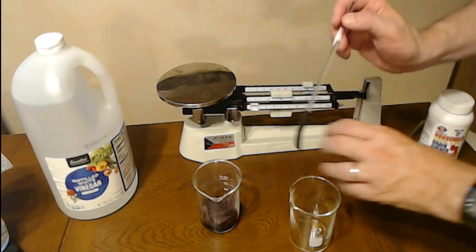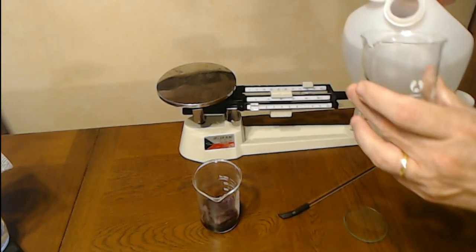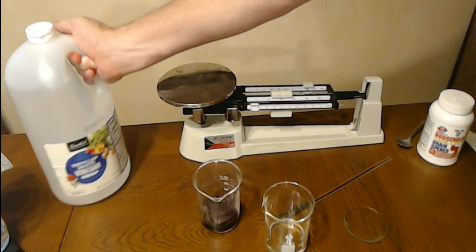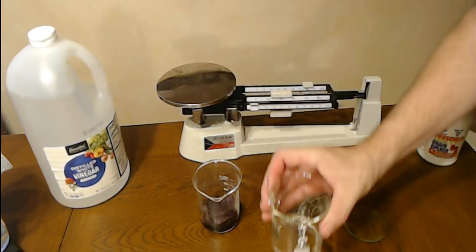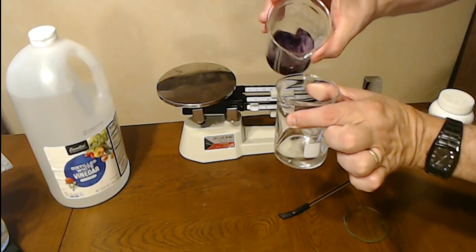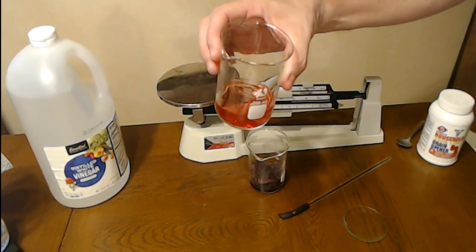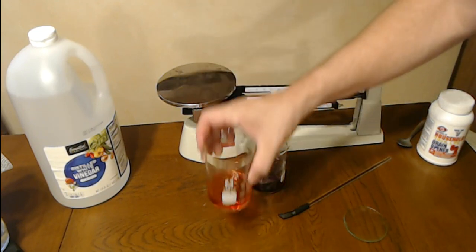So what we're going to do is, first of all, we're going to put some vinegar into our beaker. I don't really care a lot about the amount because we care about the change in mass, not the actual amount of mass. So I put about 50 milliliters in there. So that's good. So now we're going to add a little of our red cabbage juice, and you'll see a color change. The vinegar changed to pink, indicating an acid. So that's going to be our first observation.